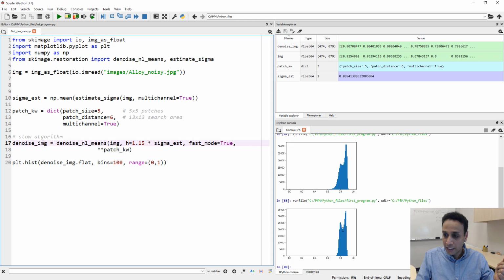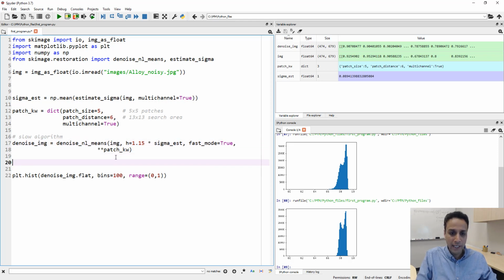Now I can actually, it's still not enough for us to use thresholding, because there's a bunch of pixels that fall between these two peaks where we have a lot of overlap. So I can expand the range. I can zoom into between 0.7 and 0.9. But let's do one more thing before we go ahead and do our segmentation.